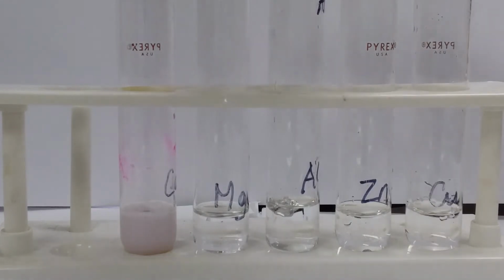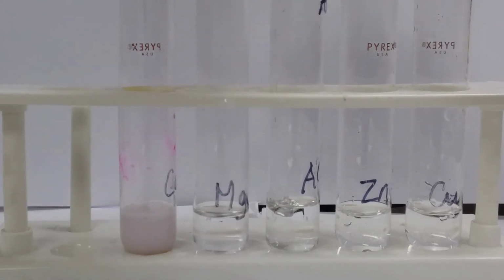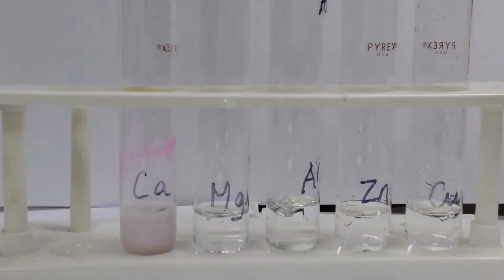So we can see that the only test tube in which something is really happening is the test tube with the calcium and the distilled water.